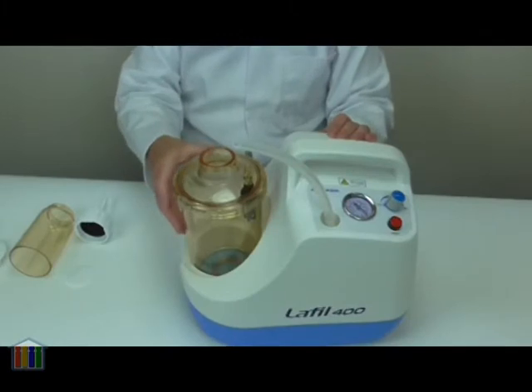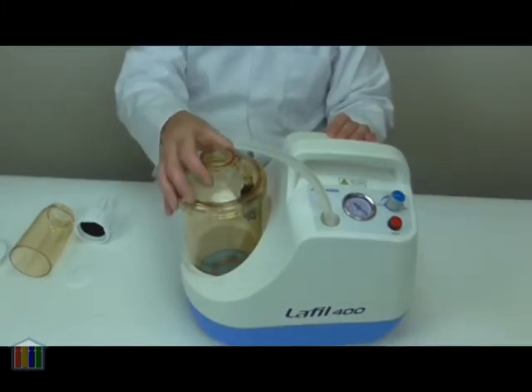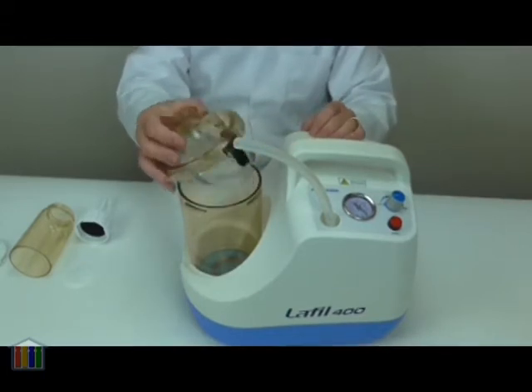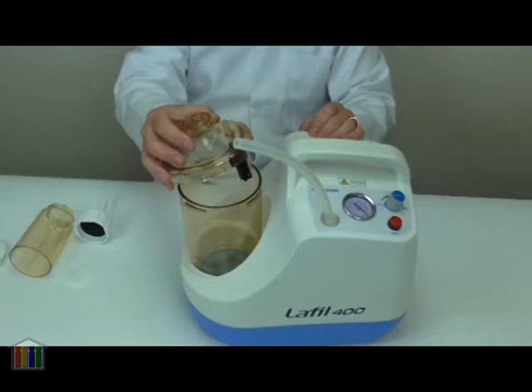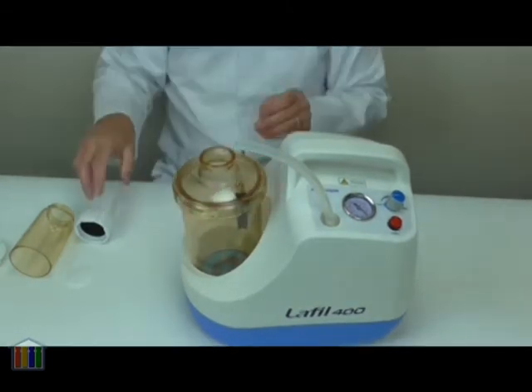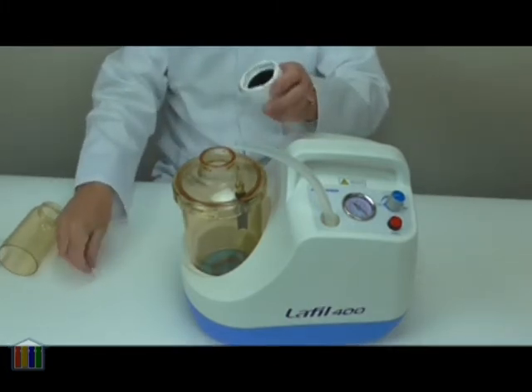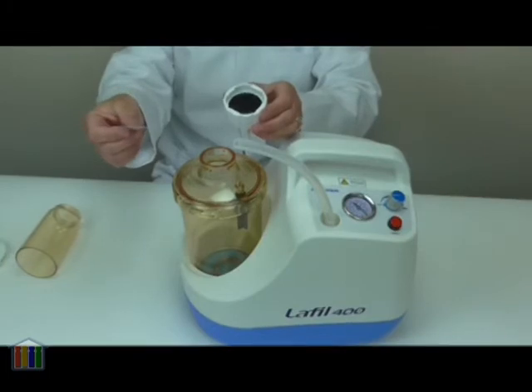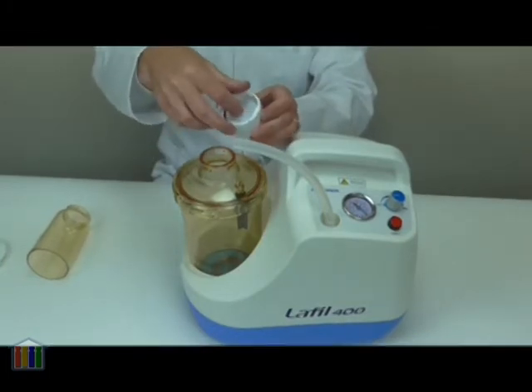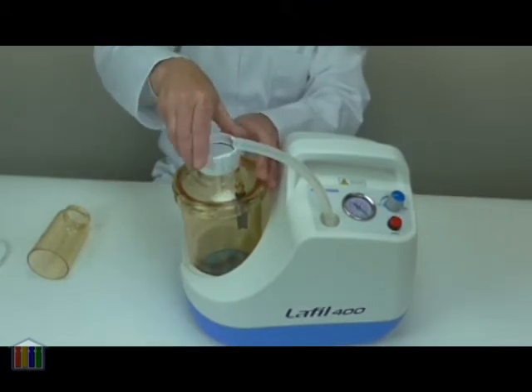The vacuum chamber can be made out of solvent resistant plastic or glass. In the lid there's a float valve that prevents liquid being drawn into the vacuum pump and also prevents accidental spillage. The lid can be simply connected by a little turn clockwise. In the top of the lid fits the filter chamber, which is designed to take a standard 47mm filter membrane that sits into the grid in the bottom of the chamber. The chamber is then fitted into the lid again by a simple turn clockwise.